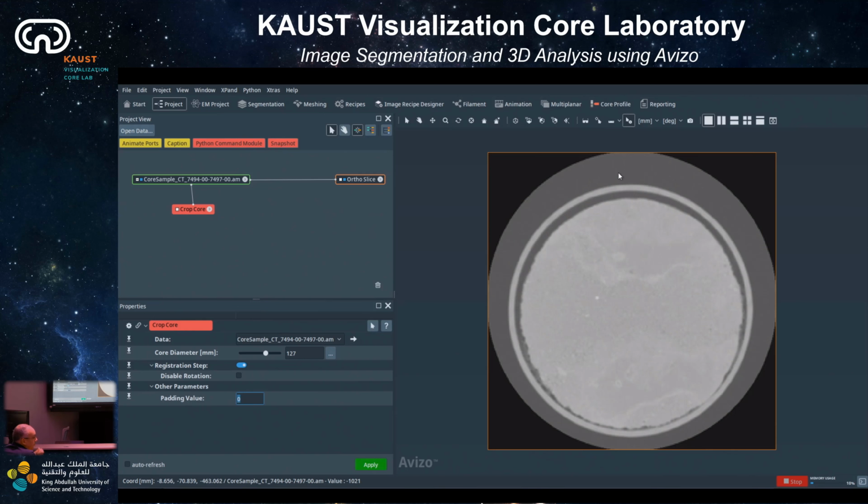So I have to put a very low value. You can put anything, maybe minus 2000, because 0 is not correct. By default, 0 should be a black background. But in this data, you can see the intensity over here with the mouse, it's still minus 1000. So if you put a padding value of 0, instead of having the black background, you might get this gray. So just put minus, let's say 2000, to be on the safe side, so you make sure everything of the data could be the padding value of minus this. Click OK. Apply.